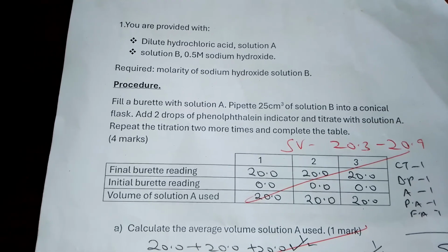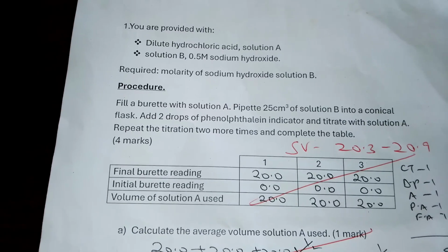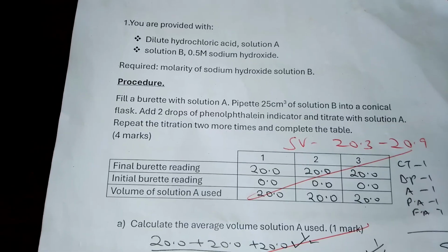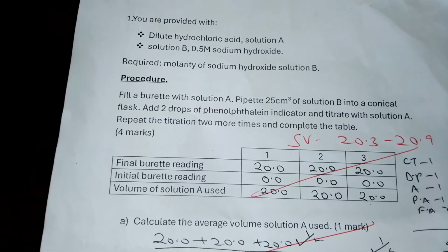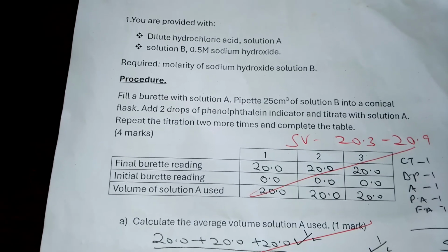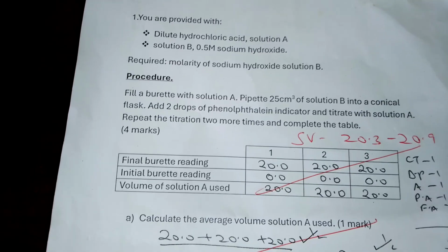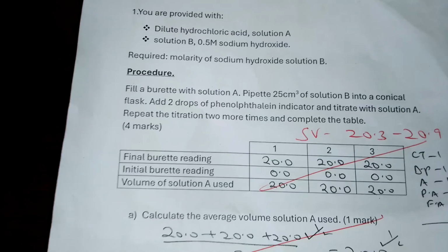Procedure. Fill the burette with the solution A. Pipette 25 cubic centimeters of solution B into a conical flask. Add 2 drops of phenolphthalein indicator and titrate with the solution A. Repeat the titration 2 more times and complete the table that is below. If you just complete the table, then you will be able to get 4 marks.